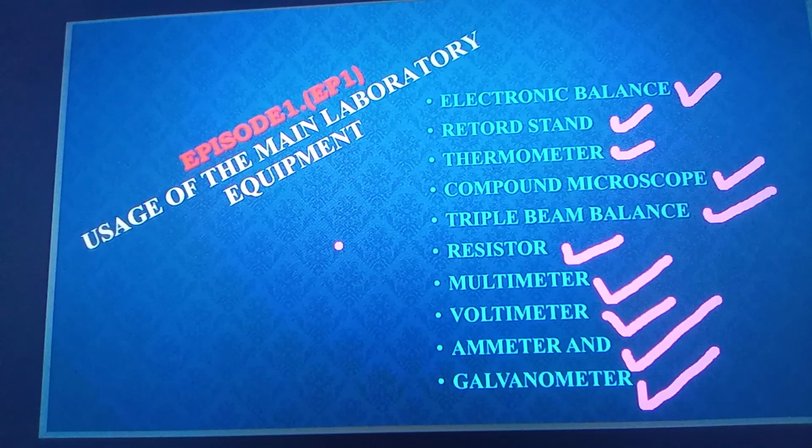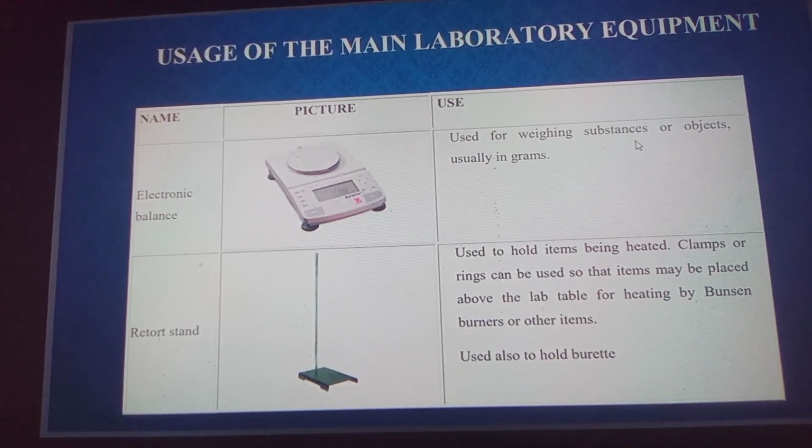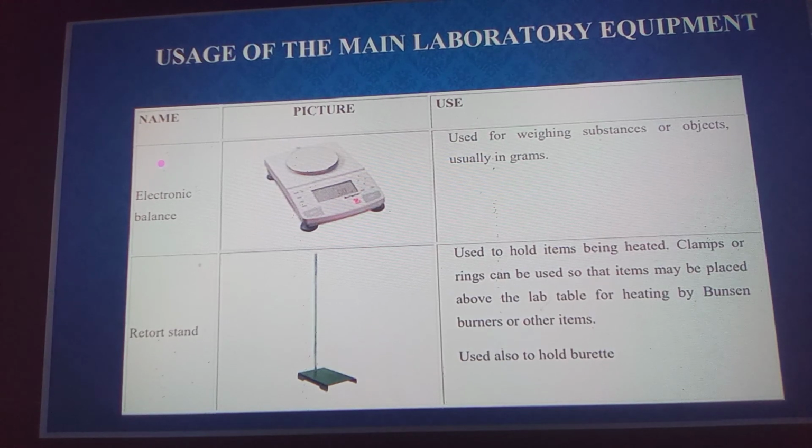So you are welcome once again. Let's start by electronic balance. So this is its image.